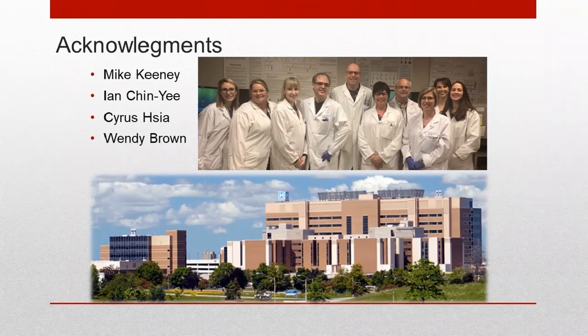So set up all the way through control, which a lot of people doing 10-color LDTs do need to have some sort of control material, and through analysis. So it does allow that part. I presume you would pay a premium for that. It's one of those things. You pay for the R&D done for it. But yeah, talk to Beckman Coulter. I'm not the right person.